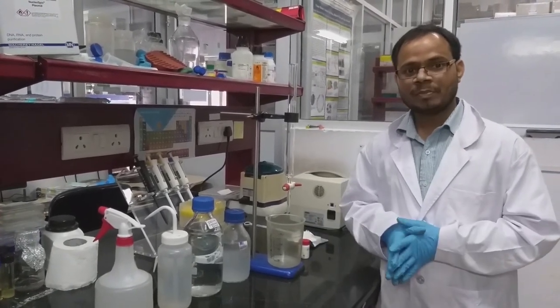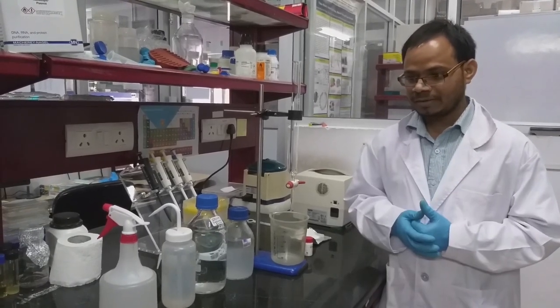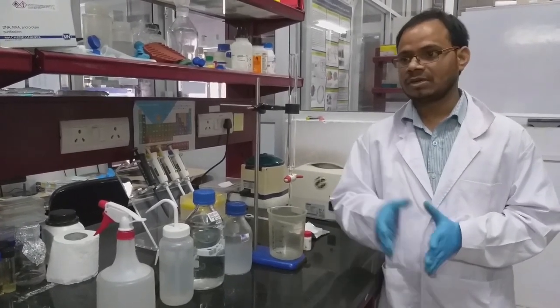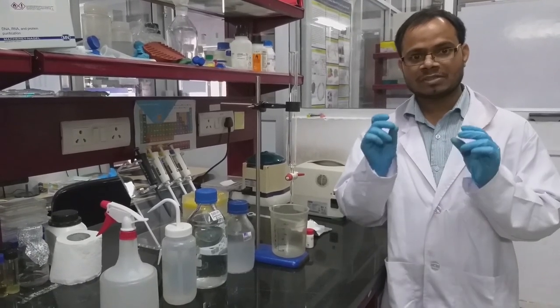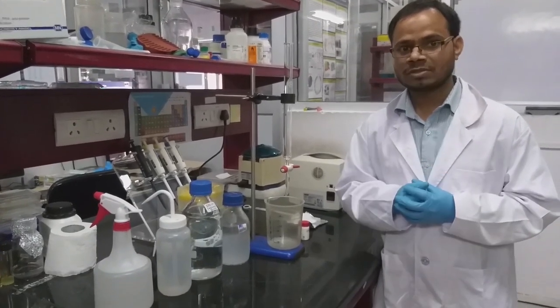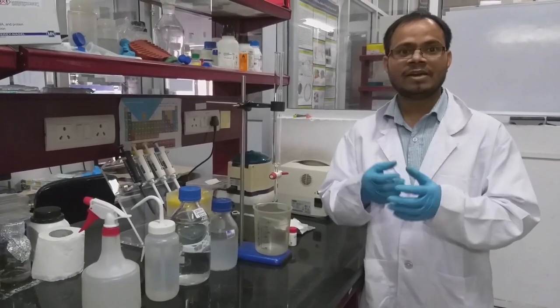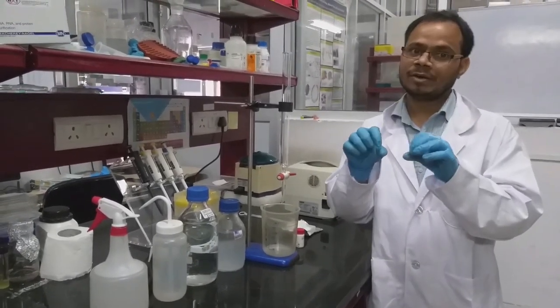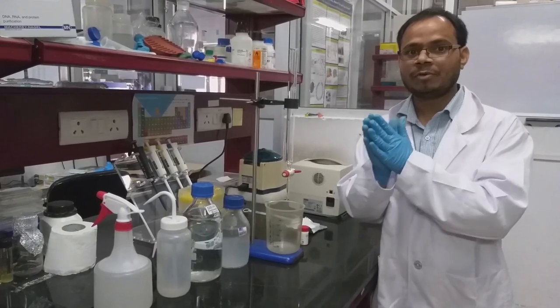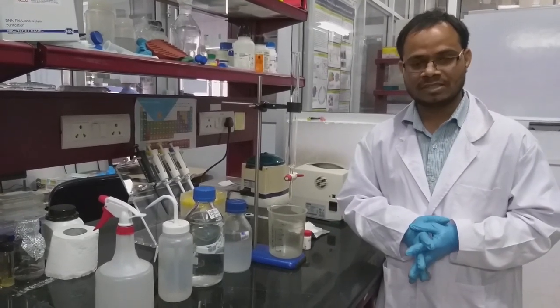In this matrix, there are beads which have small pores. Suppose you want to separate a mixture of molecules from 1 kDa to 200 kDa. The small molecule of 1 kDa will permeate or diffuse into the pores in the beads, and the bigger molecule of 200 kDa will be excluded from those pores. So it will elute first, and the smaller molecule will be retained there, and we have to give sufficient buffer to elute that one. So this is the overall concept of gel filtration chromatography.